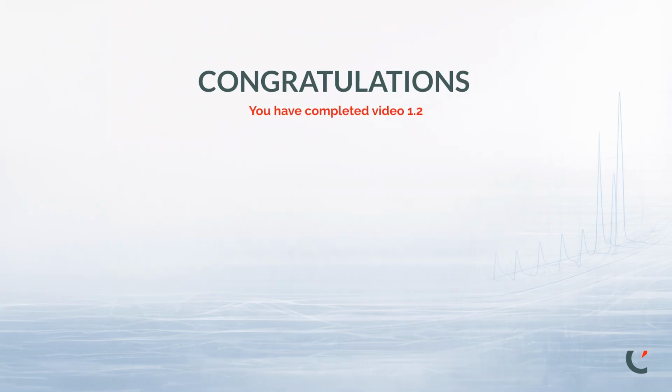Congratulations! You have now completed video 1.2 in the Chromperfect Beginner's Guide. At this stage, you understand how the system reports instrument status and what those states represent. This foundational knowledge is important before moving into practical acquisition exercises.